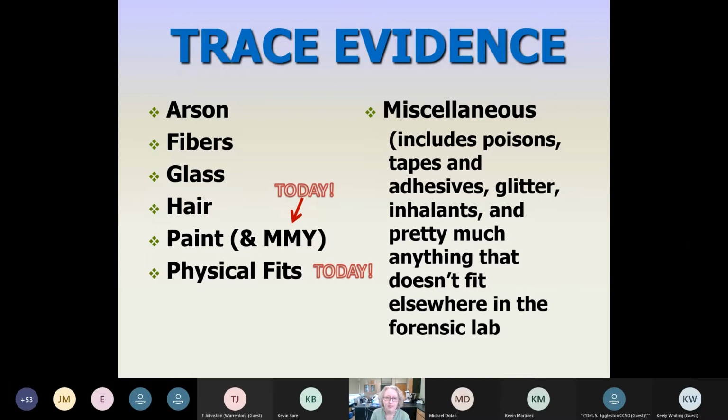And then the second part of today's presentation will cover investigative lead searches involving make, model, year information. That will include both make, model, year searches, which we abbreviate as MMY, using vehicle paint, as well as make, model, years involving vehicle parts that may have manufacturing codes on them.